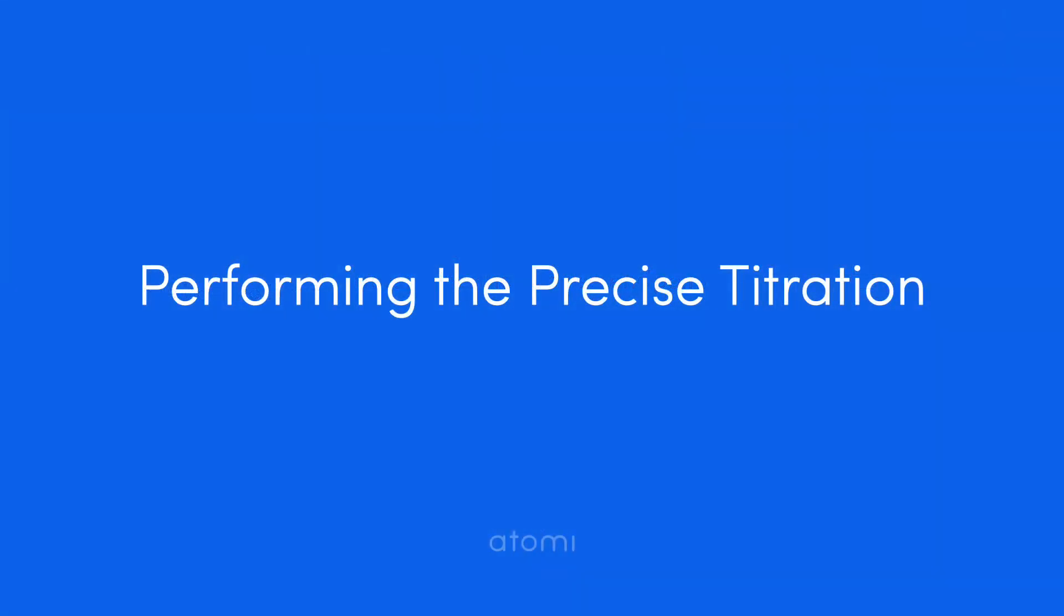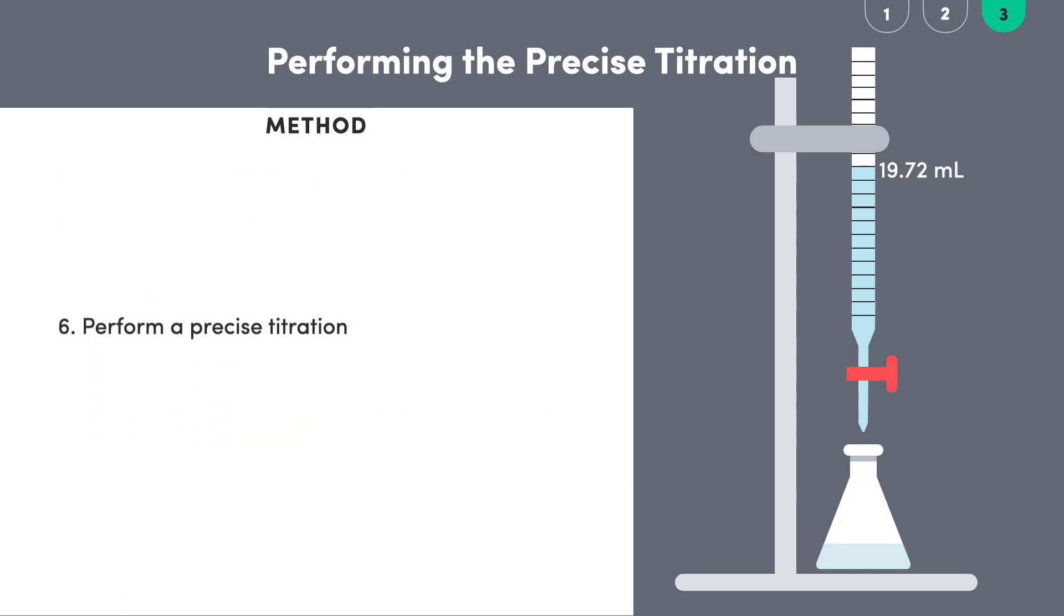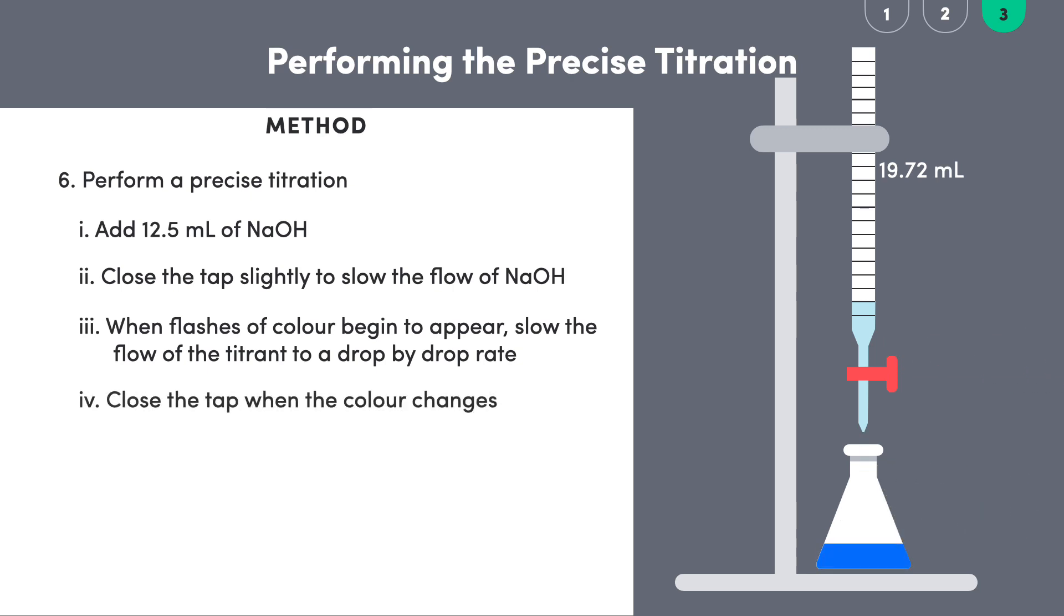Before the next run of the titration, we rinse the conical flask using deionized water and add another 10.00 milliliters of analyte along with indicator into the conical flask. We freely add 12.5 milliliters of titrant, then we close the tap slightly to slow things down. When flashes of color begin to appear in the analyte, we slow the flow of the titrant so it's being added just drop by drop. This is the part of the titration that requires a fair bit of patience and care, as it may take only one extra drop for the indicator to reach the endpoint, at which point you've got to stop the dripping straight away.